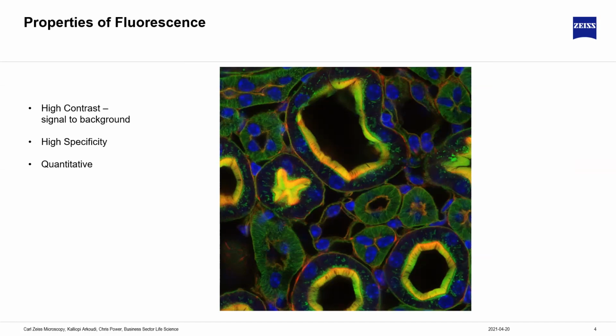And this really comes to when you think about what the word microscope means and what a microscope does. Microscopes really help you to see stuff. I know it sounds very basic, but to help you see things, you need three things. It's magnification, it's contrast, and it's resolution. So the magnifying part is the part most people think of, to make it look bigger. Contrast depends on the technique, and it's what fluorescence gives us. And resolution is the ability to distinguish two objects which are close to each other.